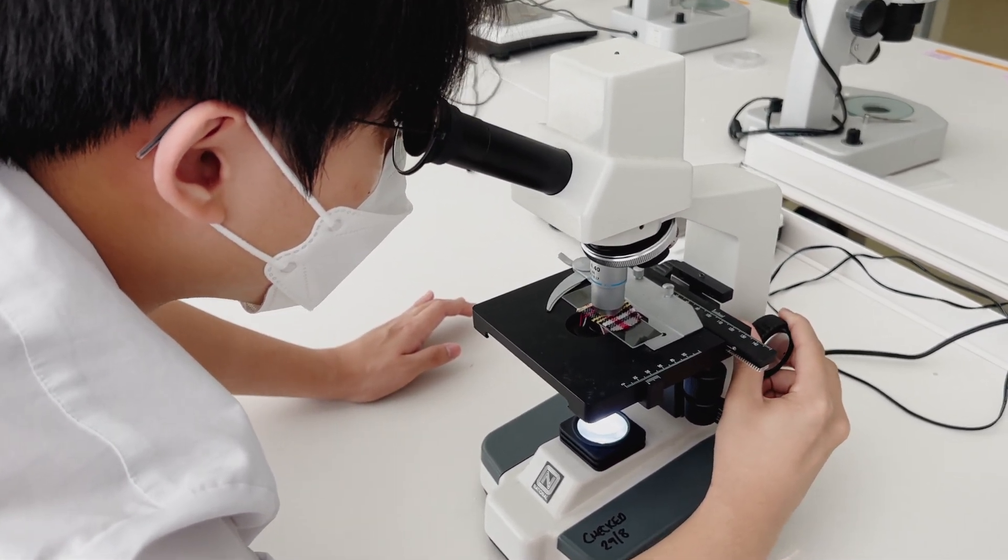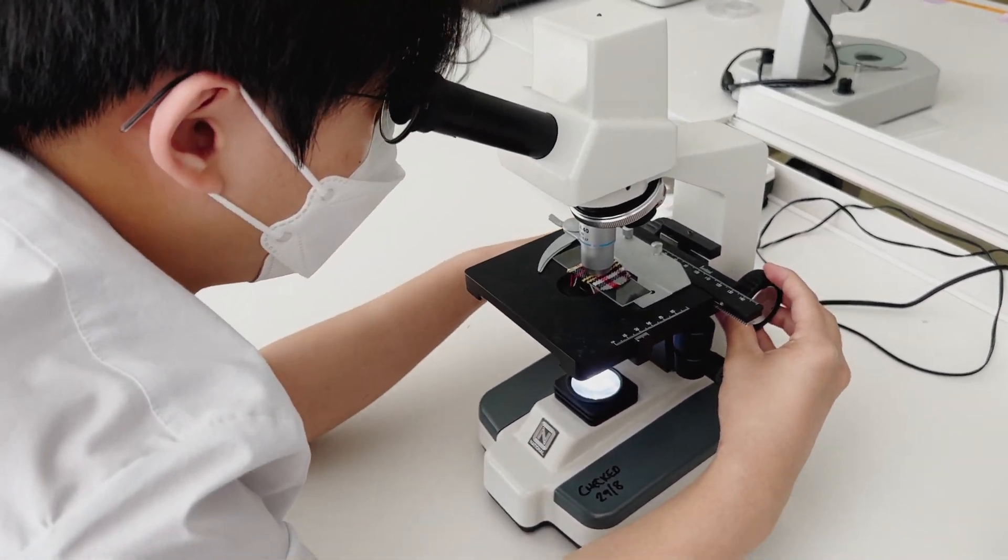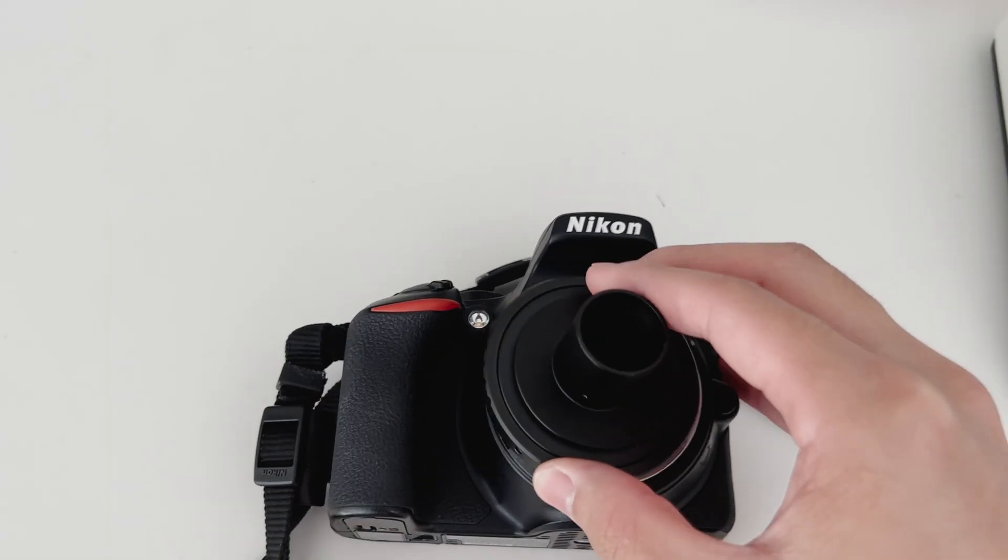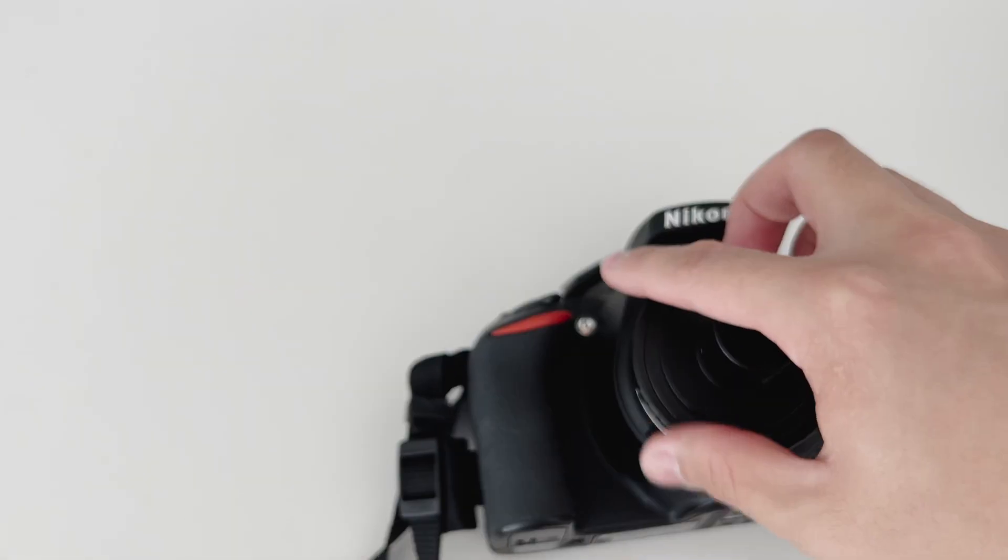Next, we move on to taking the photographs themselves. First, set up your SD card and battery. Then, lock a microscope adapter onto the camera lens.